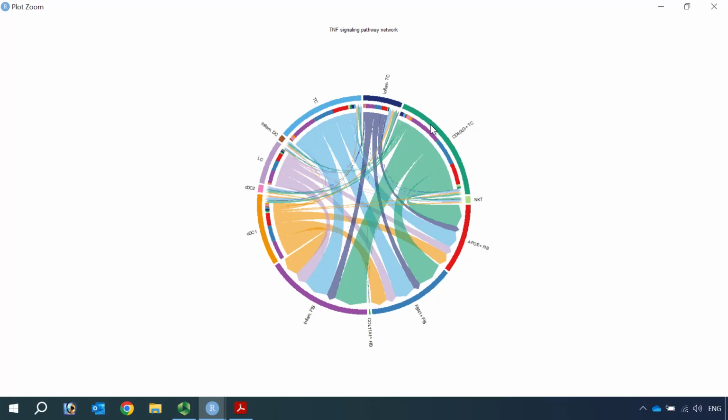The longer length means that there are more cells in this cell group, and the circle inside indicates how each cell type interacts with other cell types, and the cell types are represented by their color. You can see, as we know from the circle plot, TNF is largely produced by the immune cells. They interact with the receptors expressed on the fibroblast.